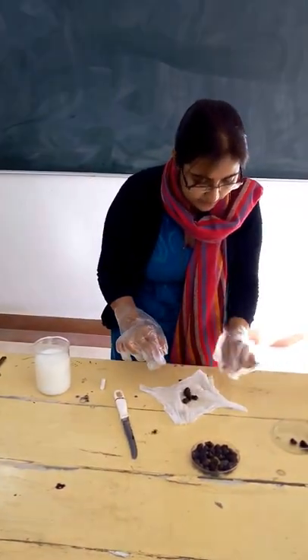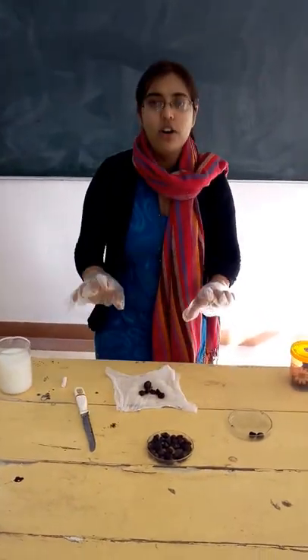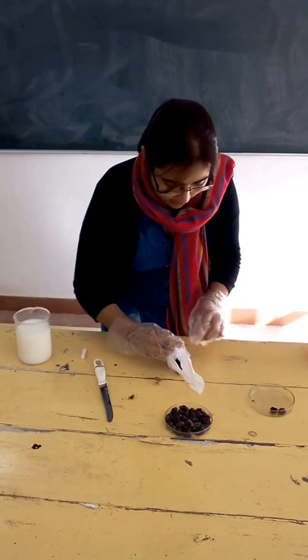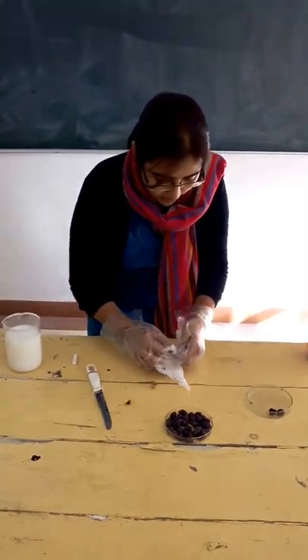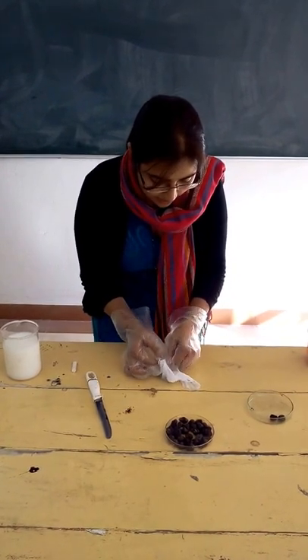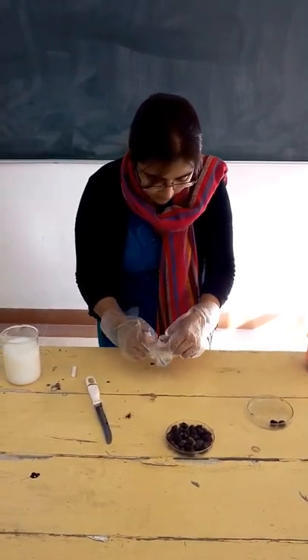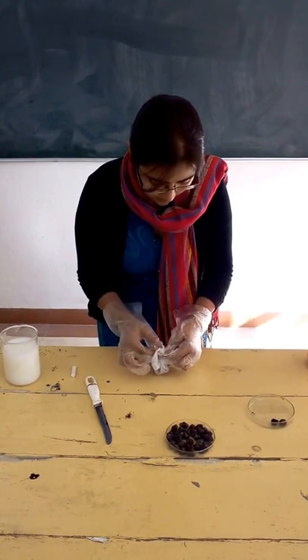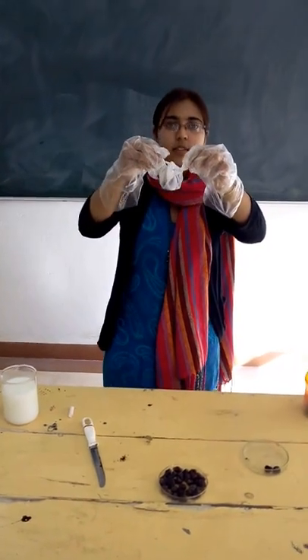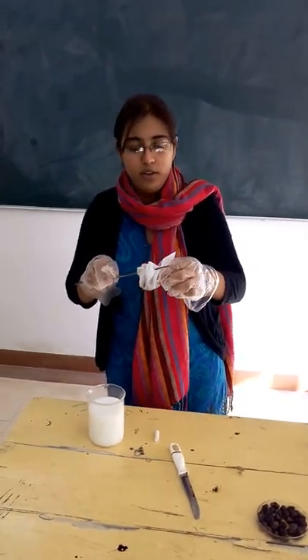We will put the flat nuts — the two half pieces of nuts — on a piece of muslin cloth or any cloth containing many pores, and we will tie it to make a bag.